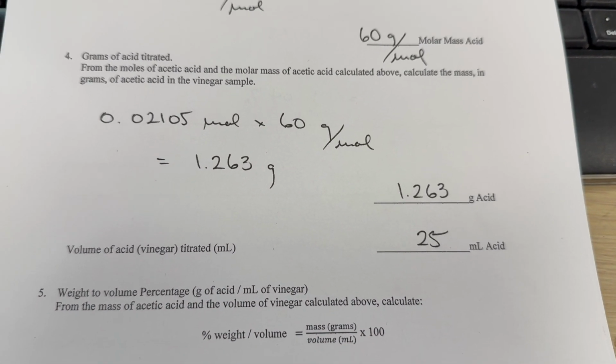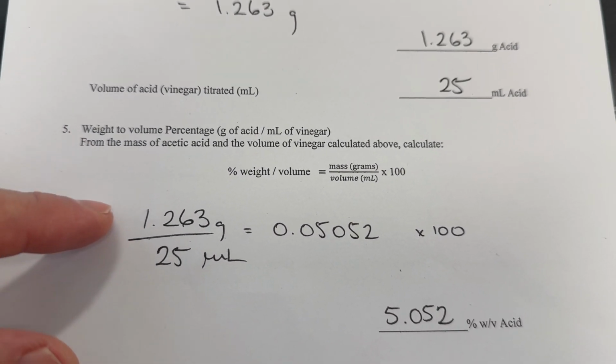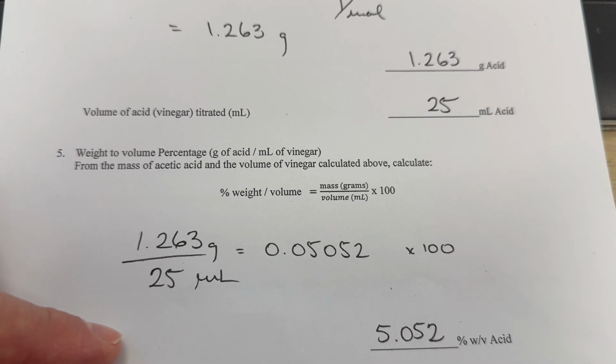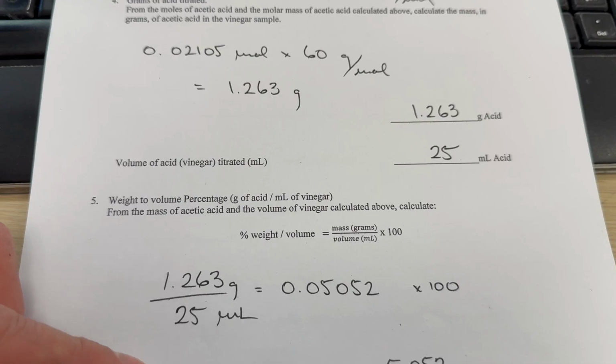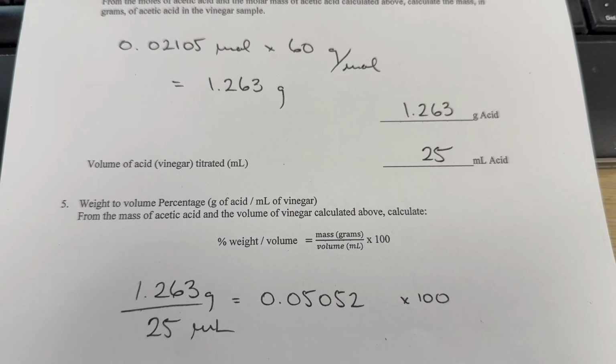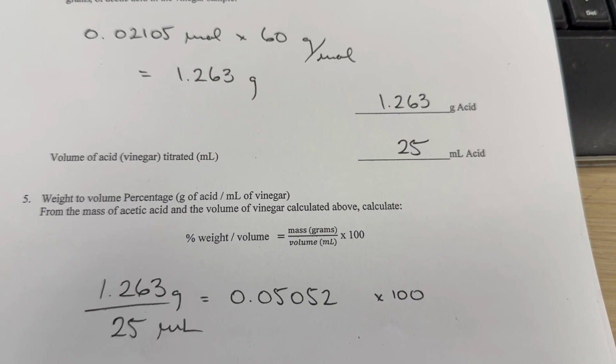And so we can calculate our percentage, grams per milliliter. So we know now we've calculated the 1.263 grams in 25 milliliters.